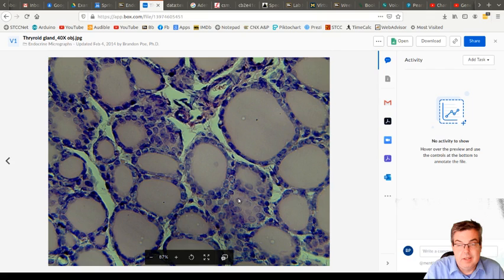So there's a little seemingly lipid background and some cells there. That's probably just shaving off the very top of the follicle. That might be. But these are probably a cluster of parafollicular cells. So we have nice dark nuclei, and we have cytoplasm that's relatively dark, especially compared to the clear glass behind it. And these are the cells that are making calcitonin.